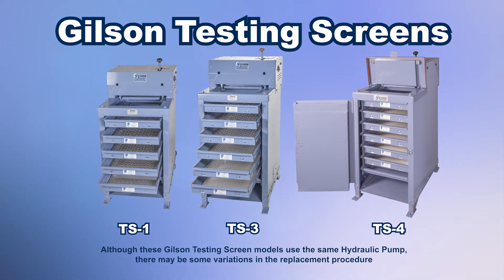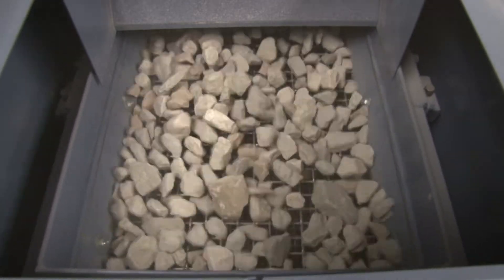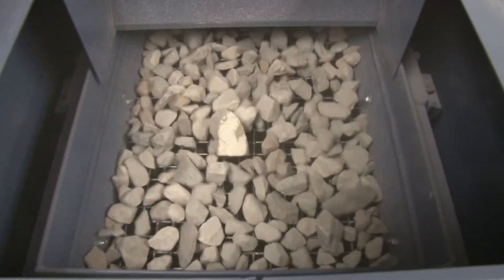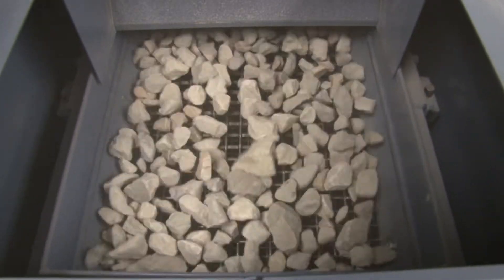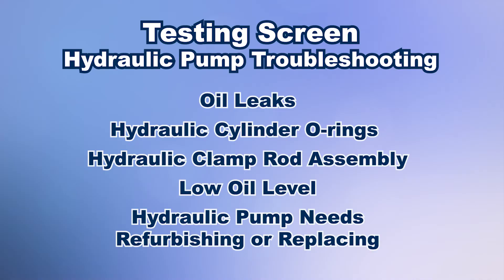If you find your screen trays are loose within the separator during testing, or you can't clamp them tight enough for testing, the hydraulic pump may need to be replaced. Before replacing the hydraulic pump, contact Gilson Technical Support to see if refurbishing the pump, replacing the O-rings on the hydraulic cylinder, or a number of other solutions should be considered.